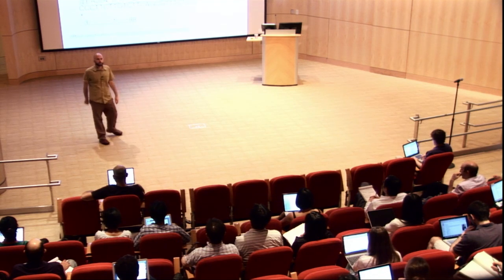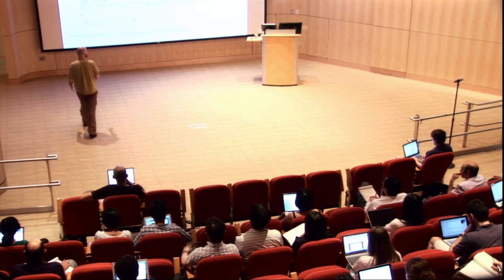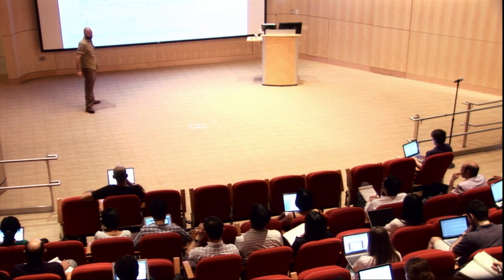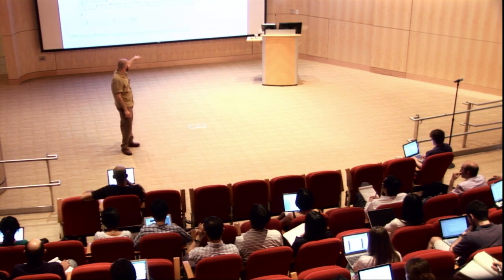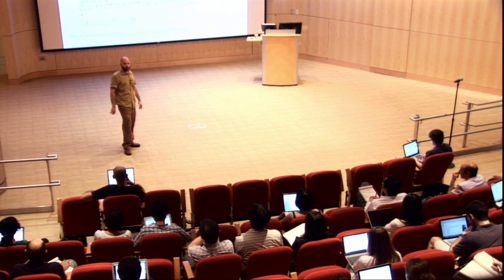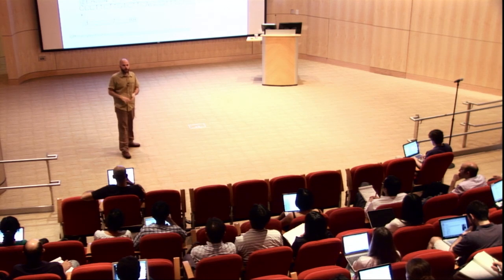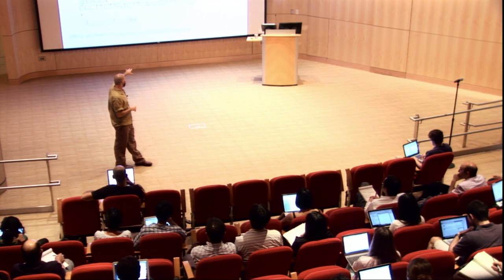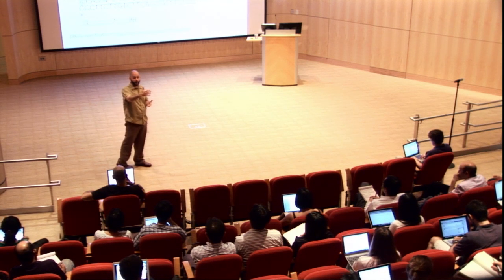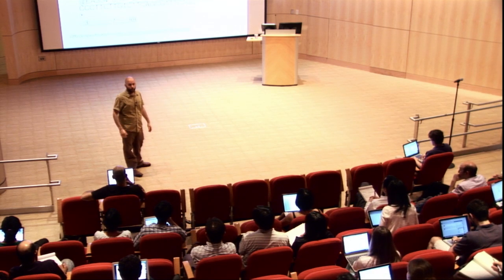Someone else? What is the maximum Phred allowed? Well, it's the maximum ASCII number. The printable characters go from 33 to like 100-something. And so the maximum Phred is like 90-something, whatever that difference is. It's just whatever's in the spec to say what the maximum printable character is. You know what I mean?